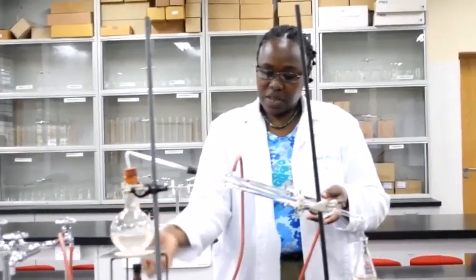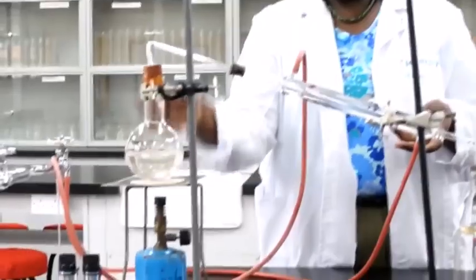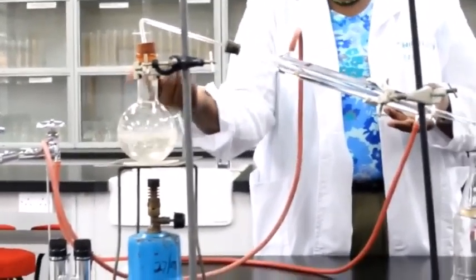This Liebig condenser is quite costly. Its price varies between 1,500 and 2,000 Kenya shillings. Some schools may not be able to afford a Liebig condenser.